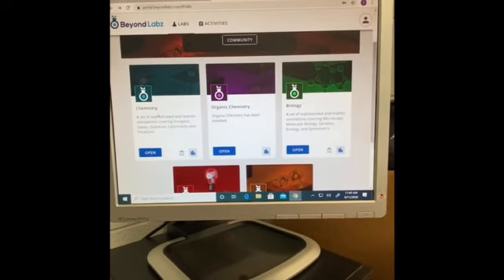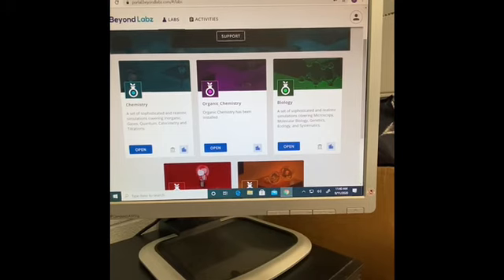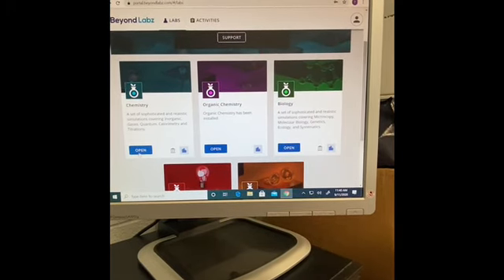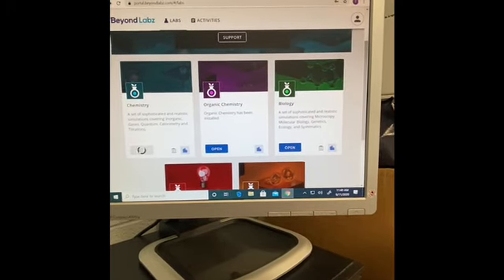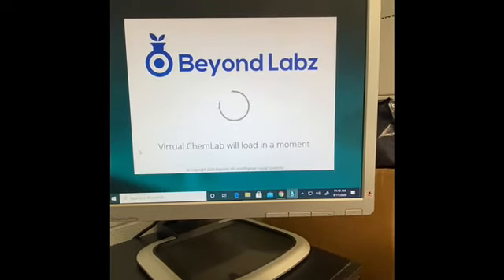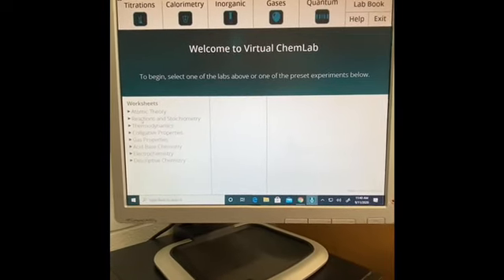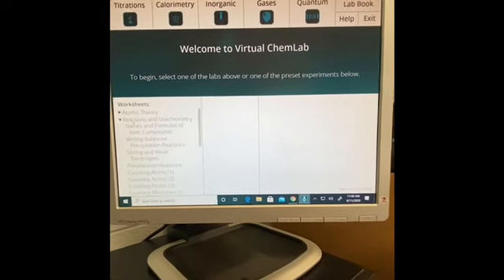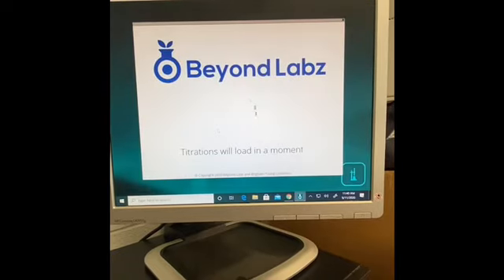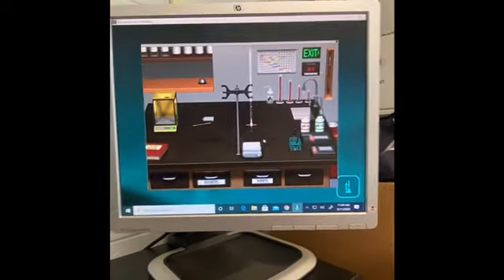beyondlabz.com. All right, first, once you've downloaded and installed, it asks you to install each of these. So it says number 1, start virtual chem lab. Open this. Select reactions and stoichiometry. So that is over here. Select reactions and stoichiometry. And strong and weak electrolytes. And now opens up the titration laboratory. Okay.